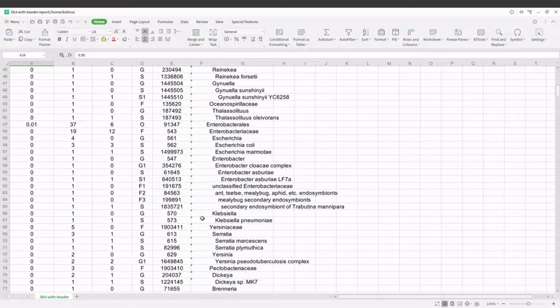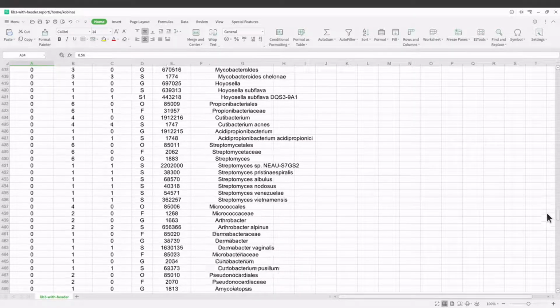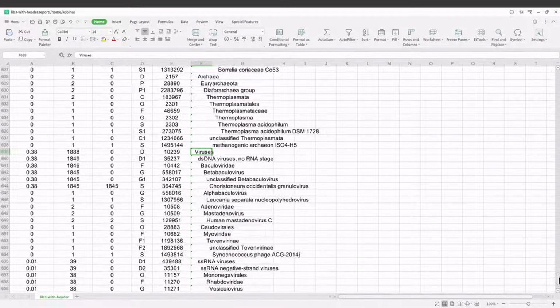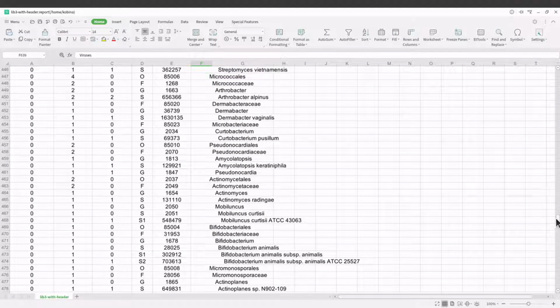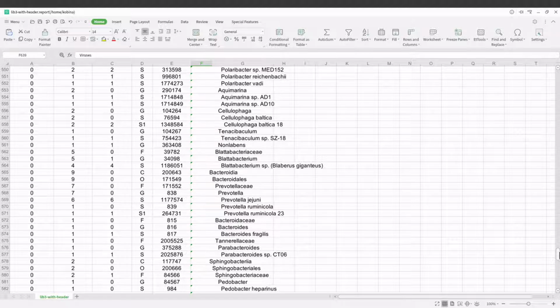So the same with bacteria. With the bacteria, we have different species as well. I also saw virus here. I think there were also classifications for viruses. So if you look at this sample in general, we have some of the reads mapping to Homo sapiens, some being mapped to bacteria, and some being mapped to viruses. This is metagenomics, so we expect different species of bacteria or viruses, and also Homo sapiens. So we will have sequences from different organisms. That's the summary of it.